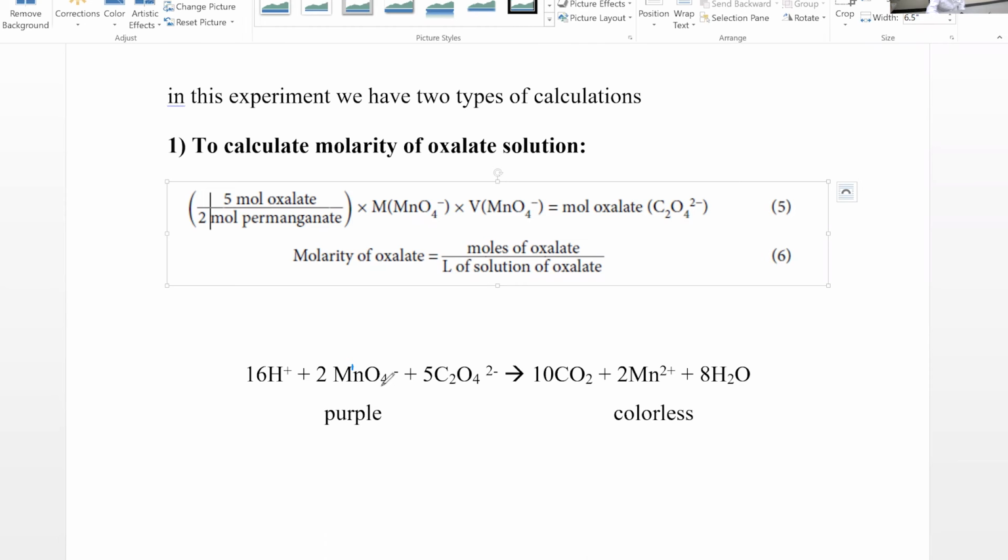The endpoint of the reaction is going to show by color change, and that means the number of moles of the compound being oxidized and the one being reduced are going to be equal based on the stoichiometry of the reaction. The balanced equation says that every 2 moles of permanganate needs 5 moles of oxalate, that is the ratio you are using. So no indicator in this reaction.